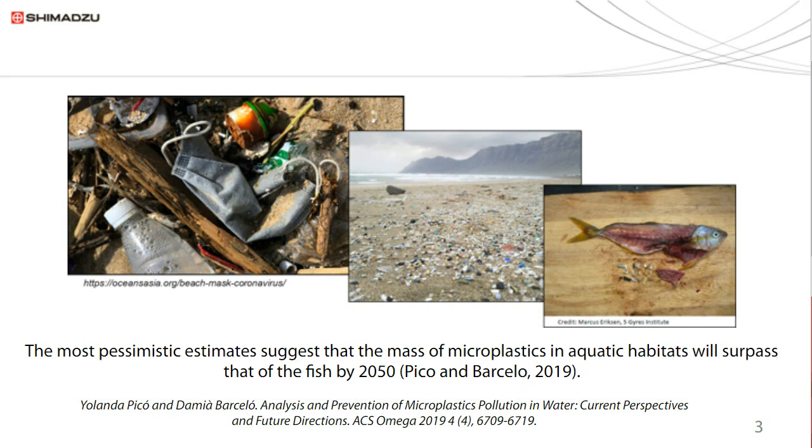So today we are going to be focusing on one specific technique that is useful for the analysis of microplastics, and that's infrared microscopy. Before Sudhir presents that work, in the next slide, I'm going to be talking a little bit more about the efforts that are happening in the United States to standardize methods that can help us in answering the questions I just mentioned about microplastics.